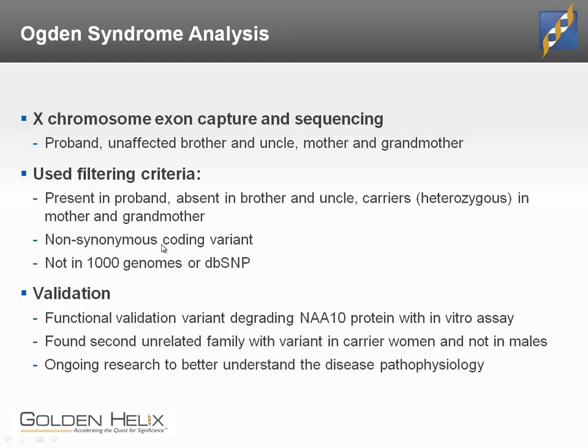Also, because it's expected to be a potentially monogenic disorder, we would expect a single variant to have to be non-synonymous to knock out the coding region of that gene, and we'll talk about more of that in more detail later. And finally, because this is a disorder that results in eventual death, we would not expect to see any adults from any of these larger consortiums or other public databases containing that variant, and hence we wouldn't expect to see the variant in these control databases.